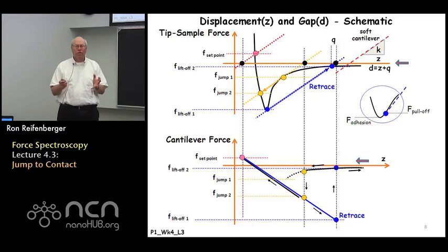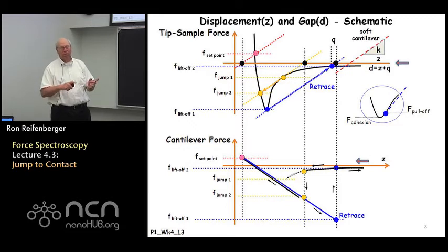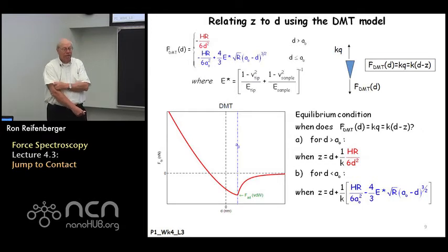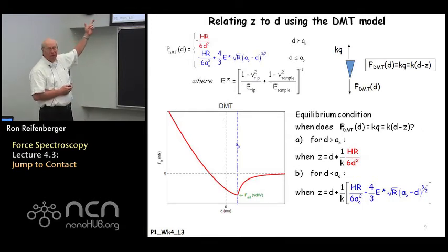This is something that you can routinely do in the Veda simulation software, and we'll focus more on that part of this discussion in week 5 of the course. But basically, I like to just select the DMT model, and the assumptions of the DMT model that we covered in week 2 of the course are summarized in the first 2 equations of this slide.